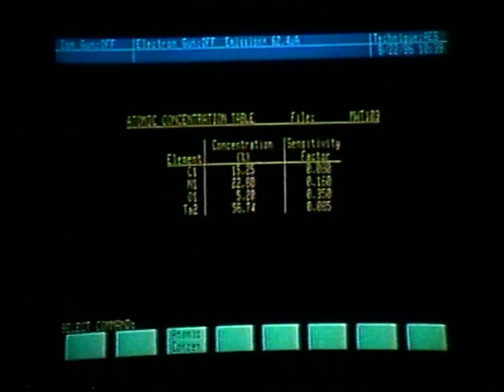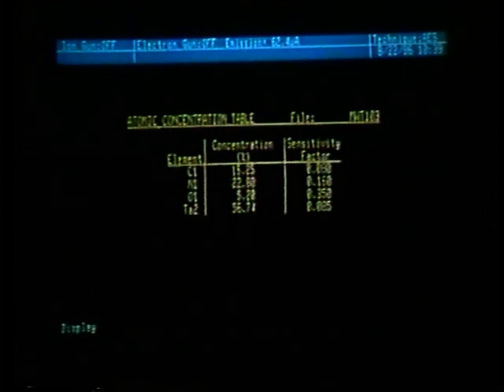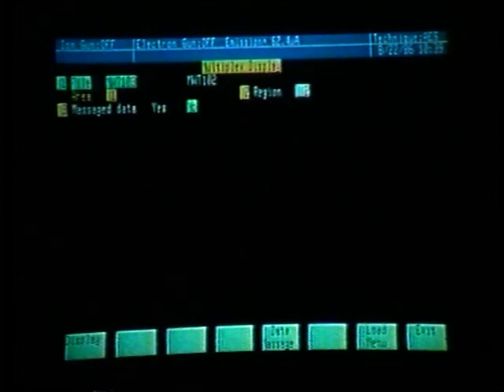Let's demonstrate one more function with the multiplex data. To again get to the multiplex display menu, we hold the Shift key and press function key 15. Let's start out and display region number 1, pressing function key 2, typing in region number 1, enter. We do not want the massage data, and we can ask to display soft key number 1.